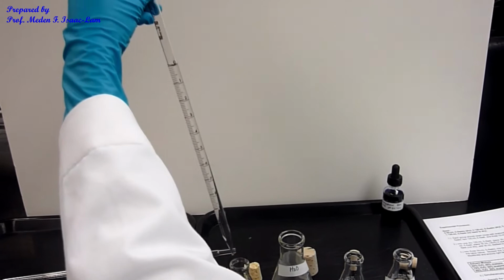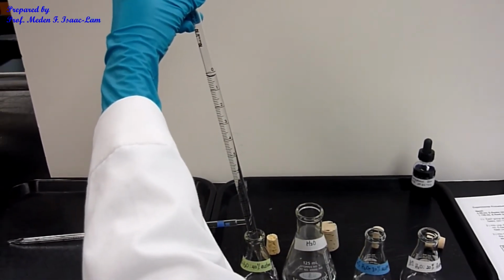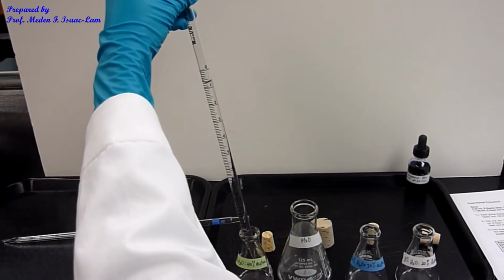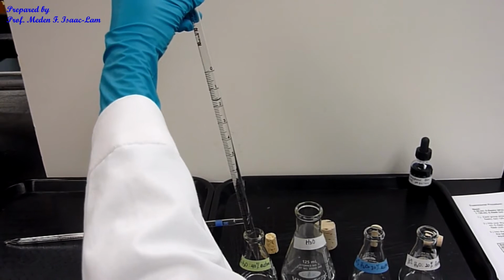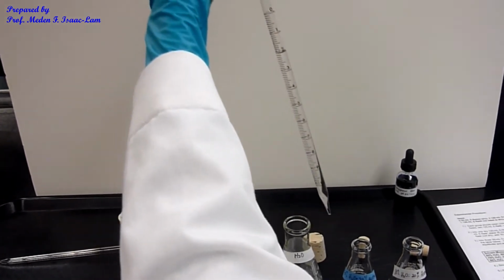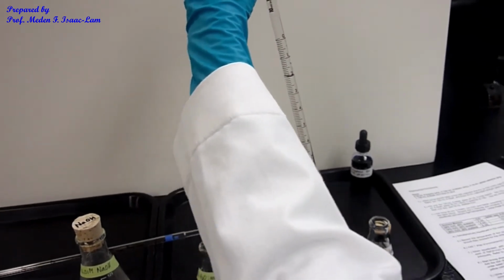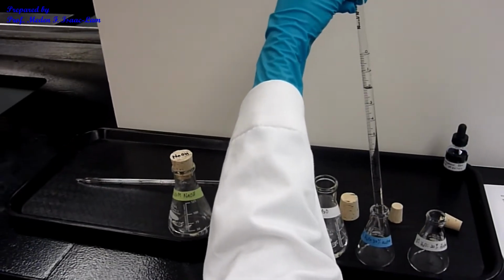Then I'm going to put 2. Stop. And I'm going to put here 4, so I'm going to end at 1, 2, 3, 4, and on to 6.